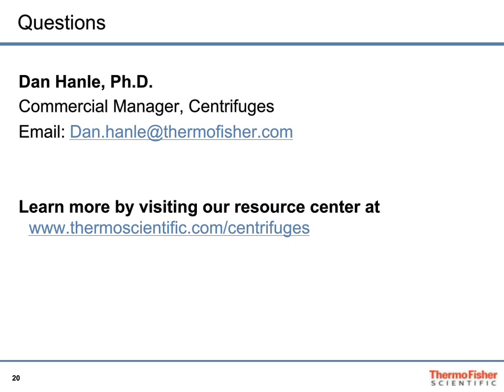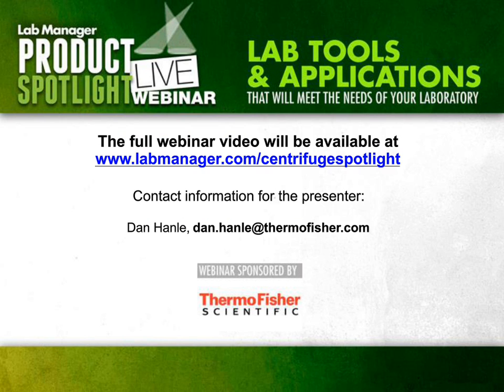We've tried at times, and I know others probably have too, where you provide online tools where you can go and say, I have to use this example, a 50 ml conical tube. What centrifuges and rotors do you have that spin that? So that would be something that we make available.